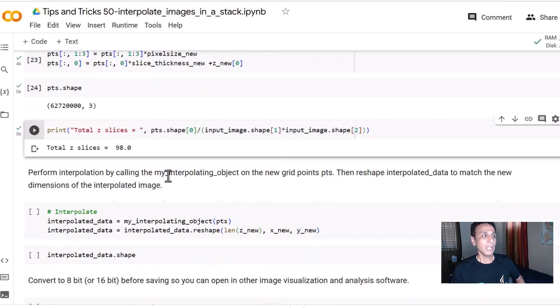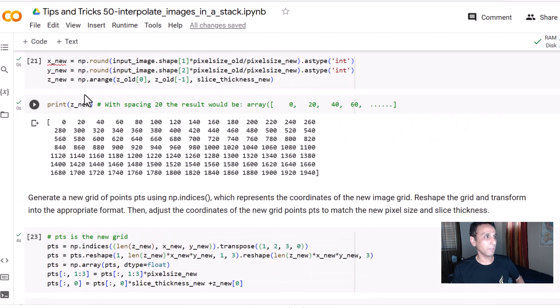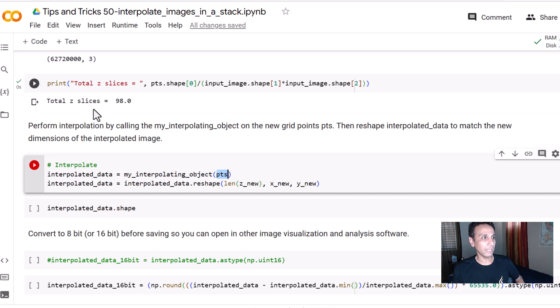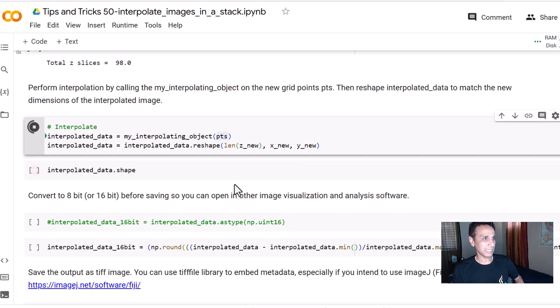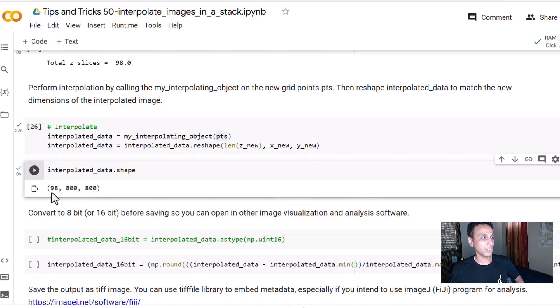We are ready to perform interpolation. We use our interpolation object and apply it onto the points, then reshape into our new shape of 98 by 800 by 800. This step will take some time depending on your resources — in my case about 30 seconds. After about 27 seconds it's done. The shape is confirmed as 98 by 800 by 800.